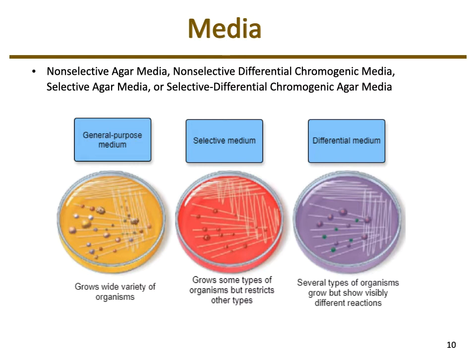An example of this would be the MacConkey agar. The MacConkey agar looks at lactose fermentation, and if the bacteria undergo lactose fermentation and take up bile salt, it will turn a pink color. So you can determine the different types of bacteria based on whether they turn pink or don't turn pink.